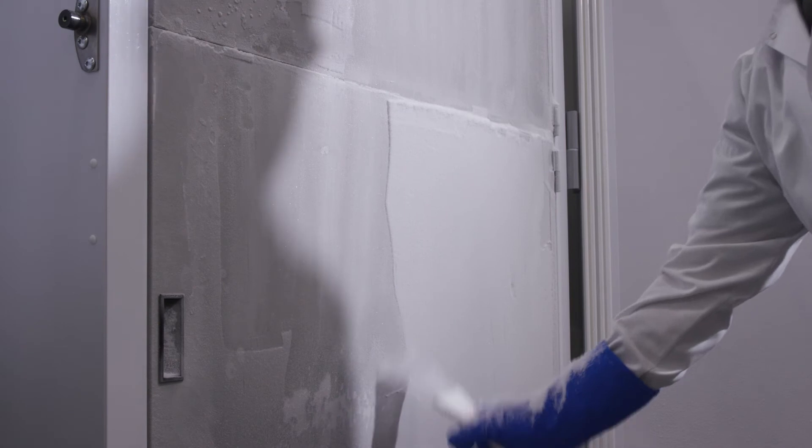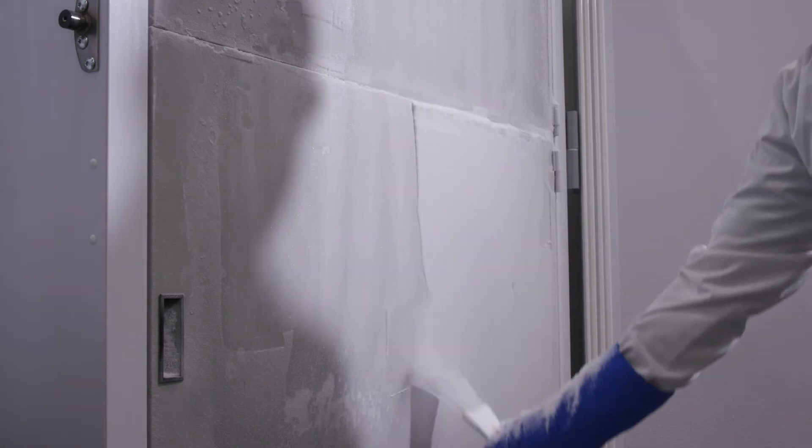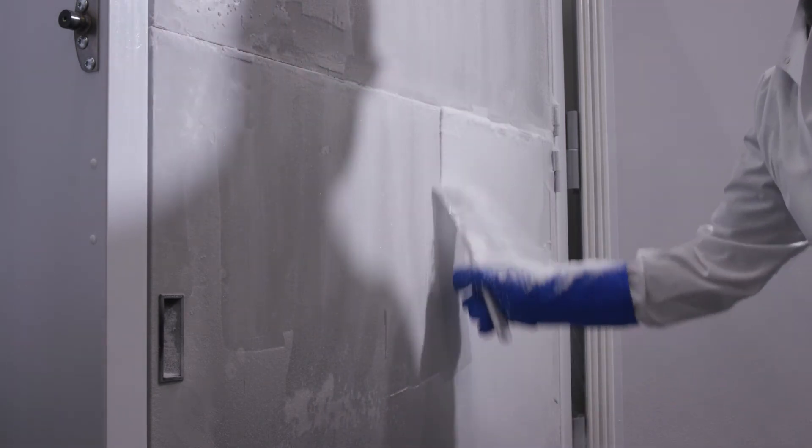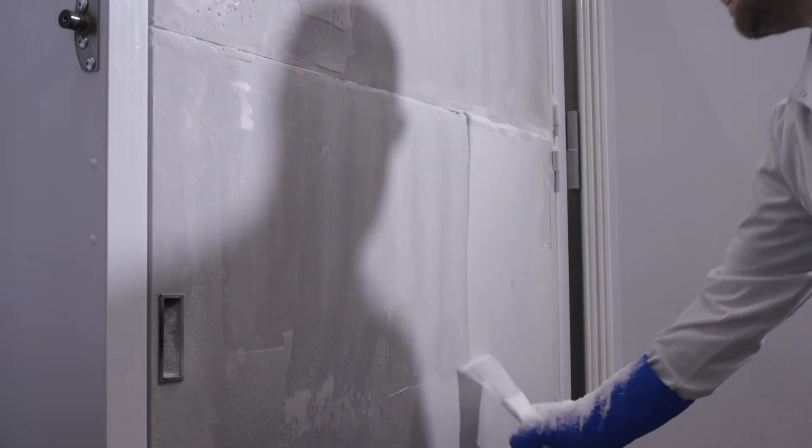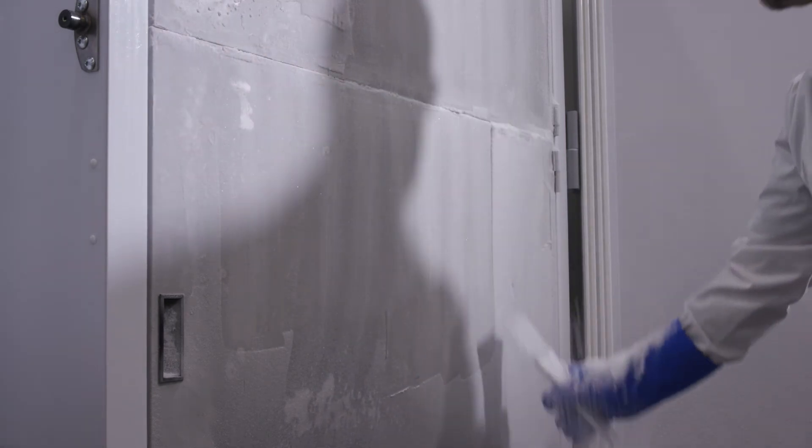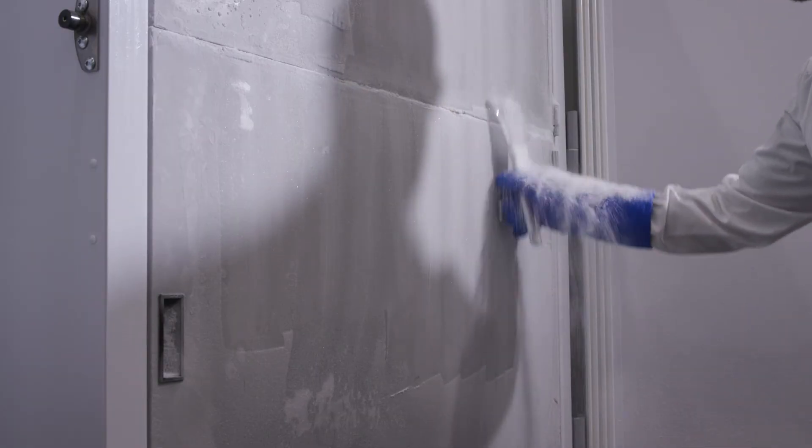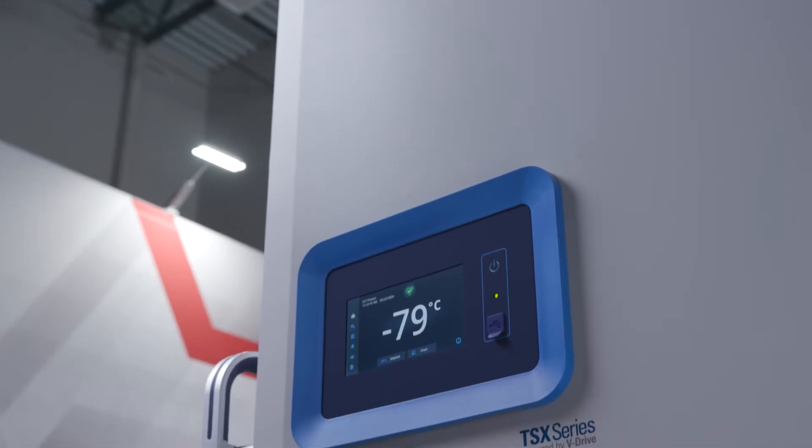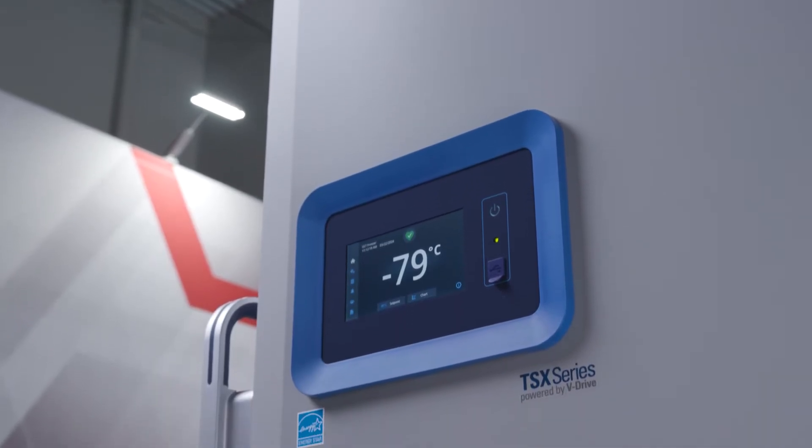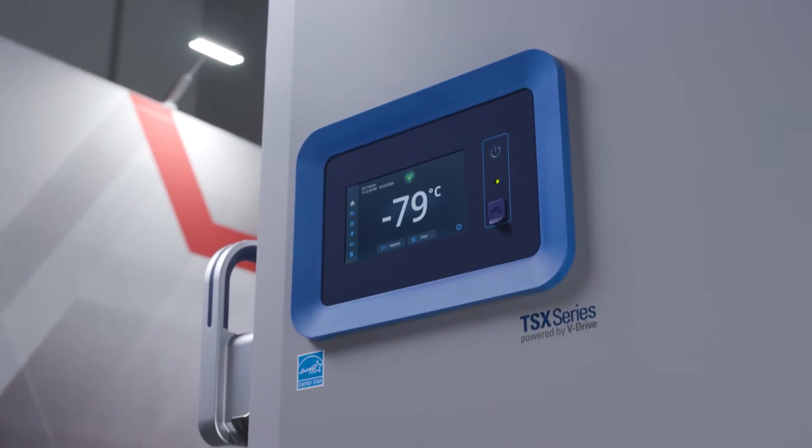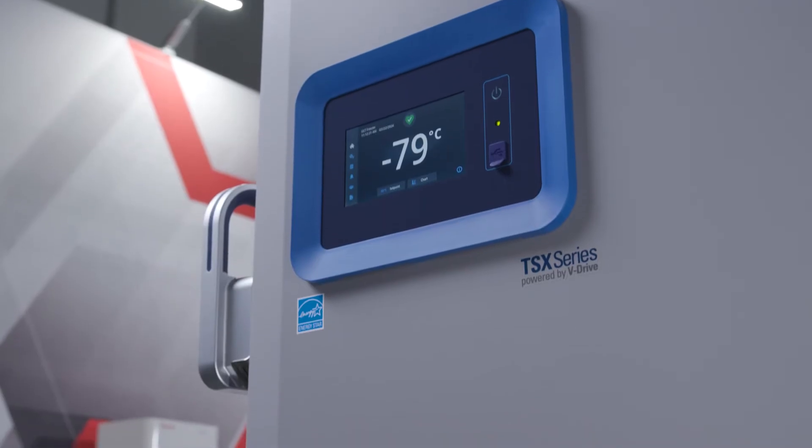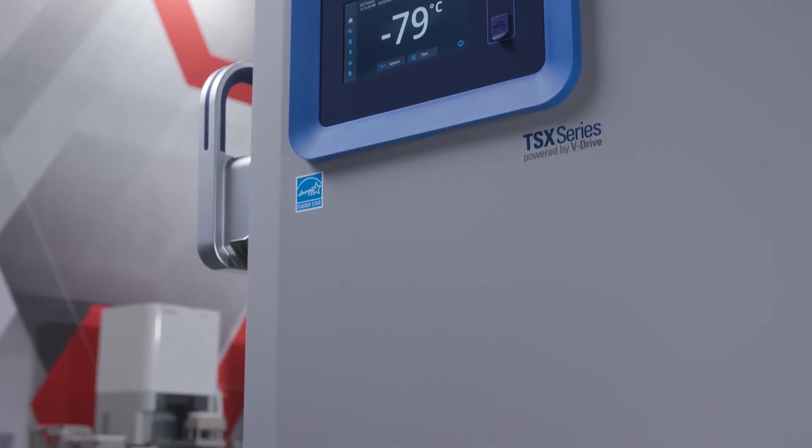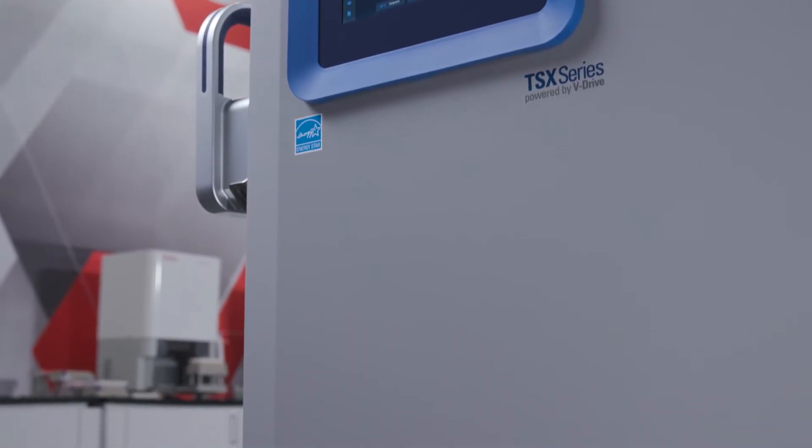Layers of frost can also build up on the inside of the unit. When this happens, it can actually act like an insulator, but that's not a good thing. Frost and ice buildup can actually impact the heat transfer through the cabinet walls, which is necessary to control the interior temperature.